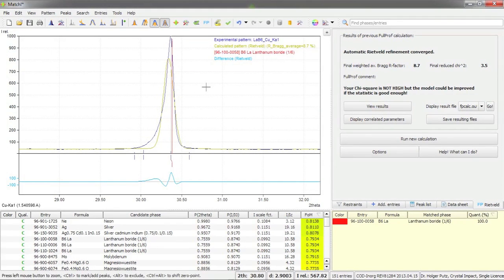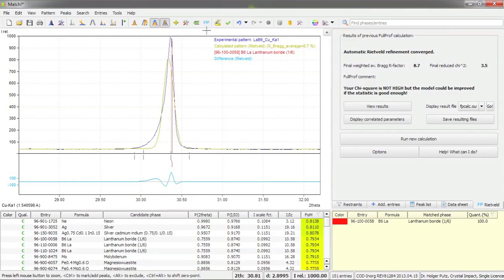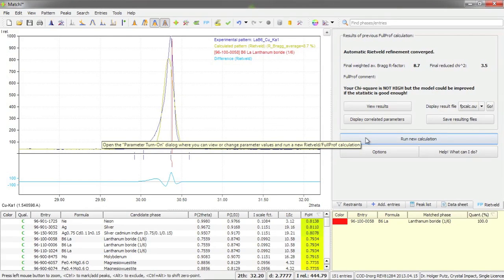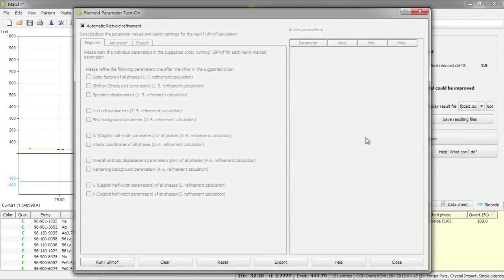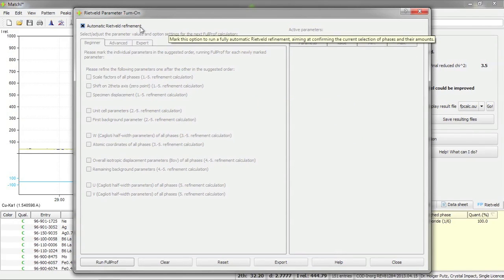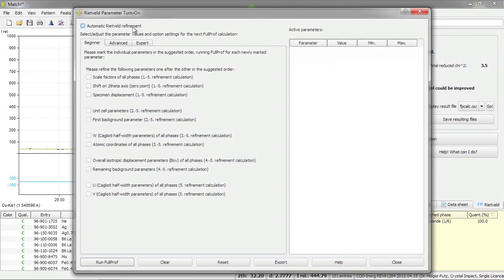In order to run the second Rietveld refinement calculation I could either use this FP button as before or I can press this run new calculation button here on the right hand side. Both will bring up the parameter turn-on dialog and this time I do not want to use the automatic Rietveld refinement but select the parameters manually instead.